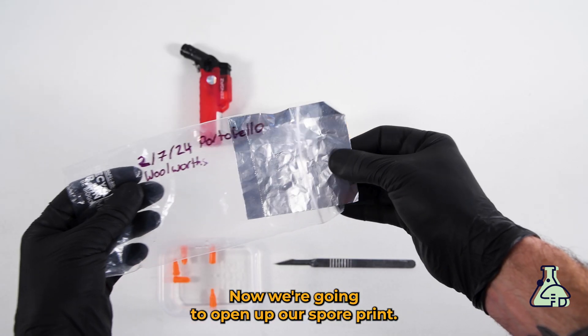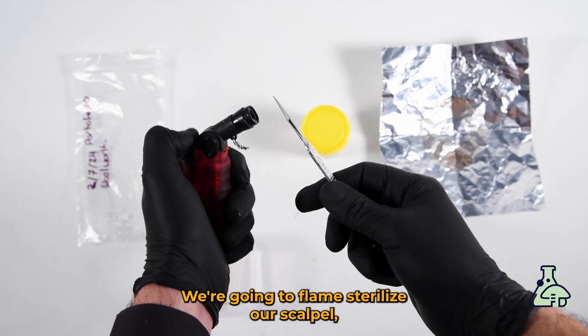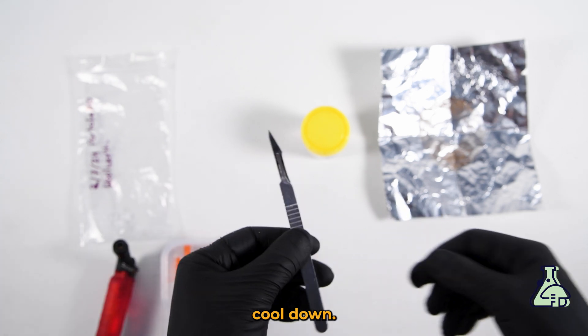Now we're going to open up our spore print. We're going to flame sterilize our scalpel, making sure that it turns red hot, and then letting it cool down.